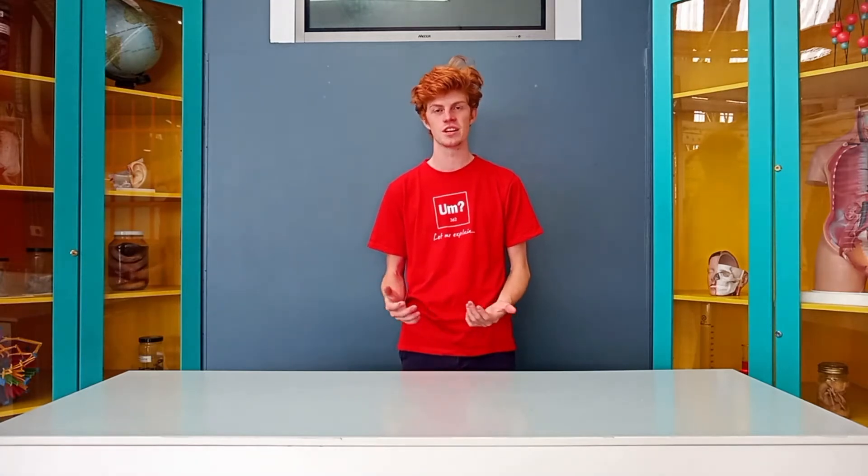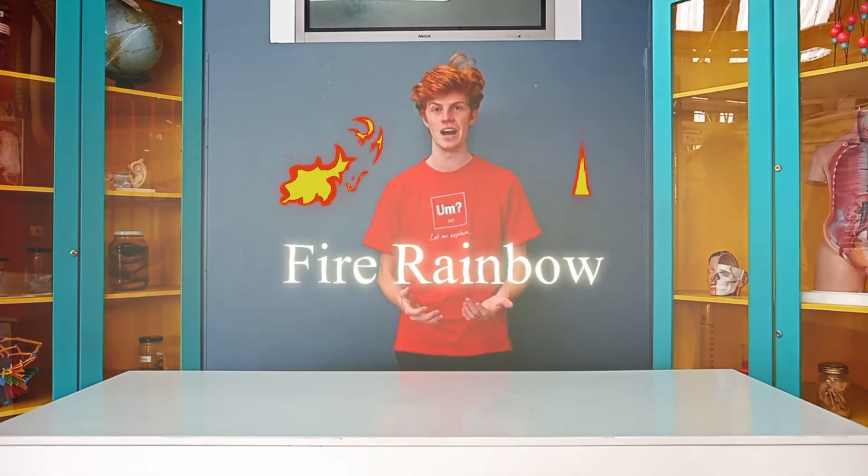Hi guys, welcome to the Cape Town Science Centre's YouTube channel. Have you ever seen fire in all the different colours of the rainbow? Well today, with a little bit of science and some chemicals, I'm going to show you the fire rainbow. My name is Nick, and I'm going to be showing you our famous fire rainbow experiment.